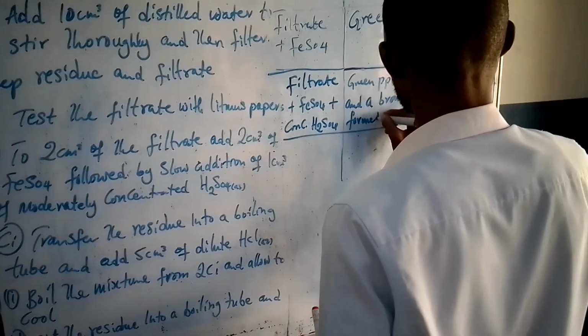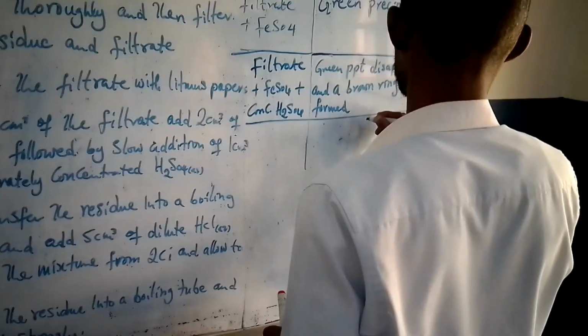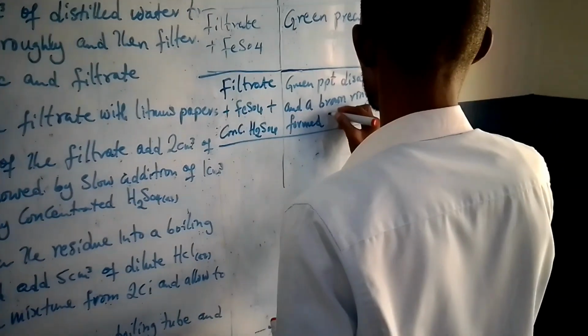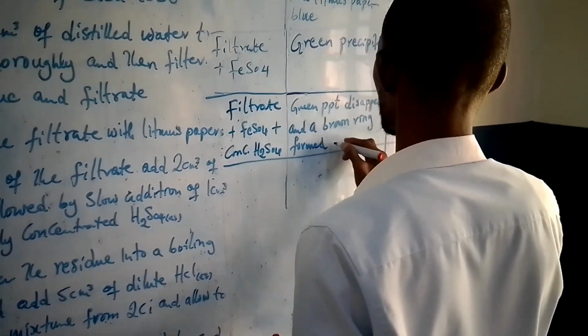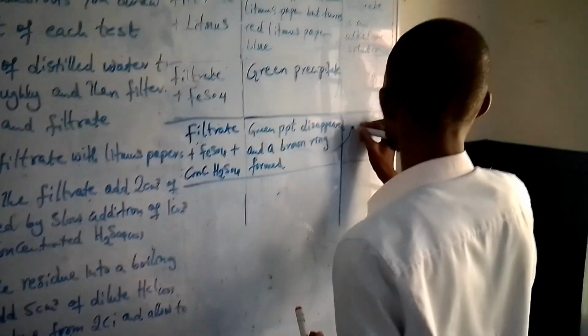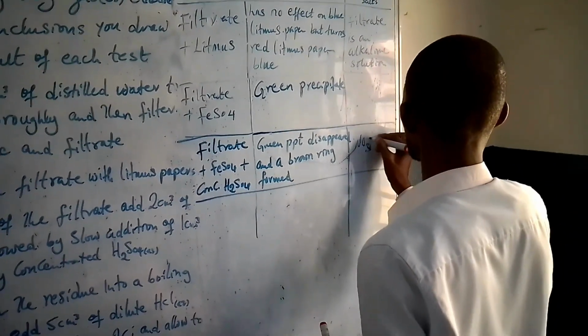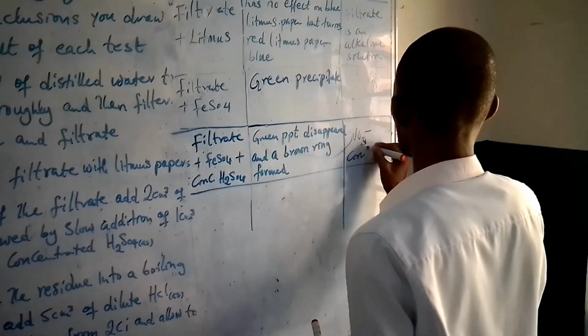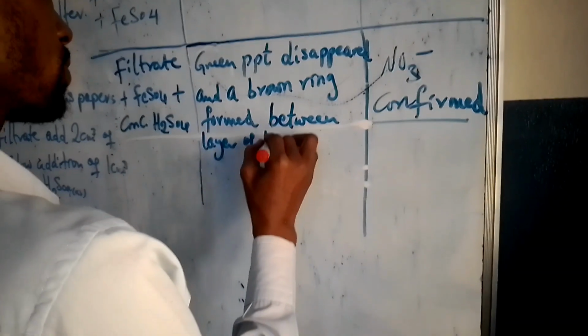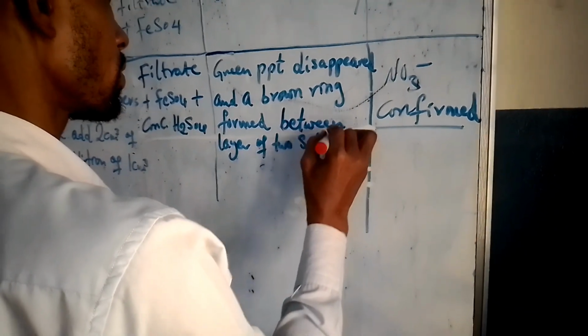A brown ring formed. NO3 minus confirmed in solution.